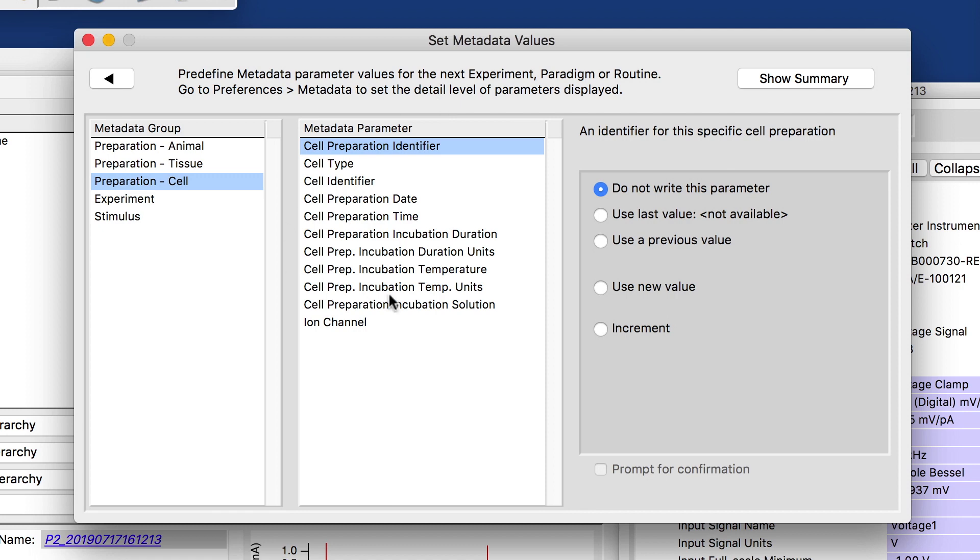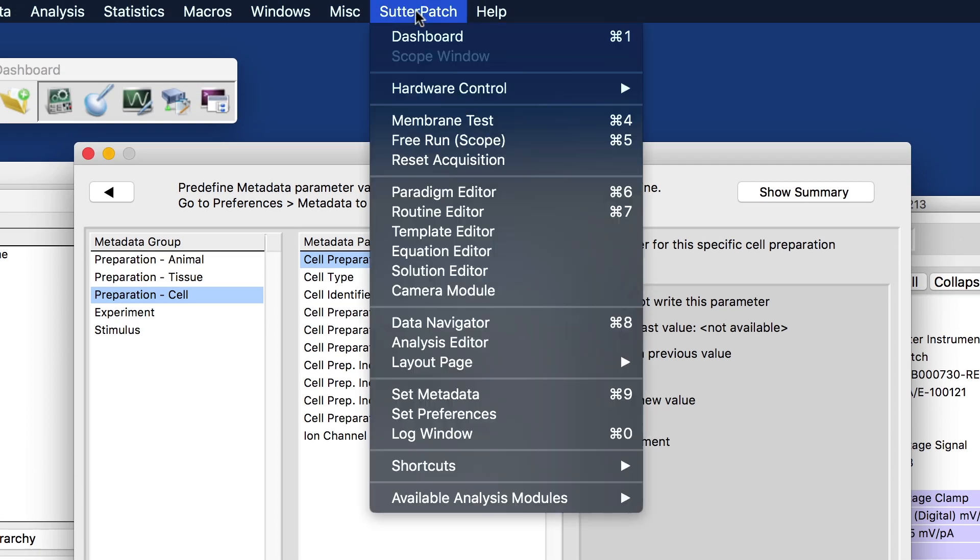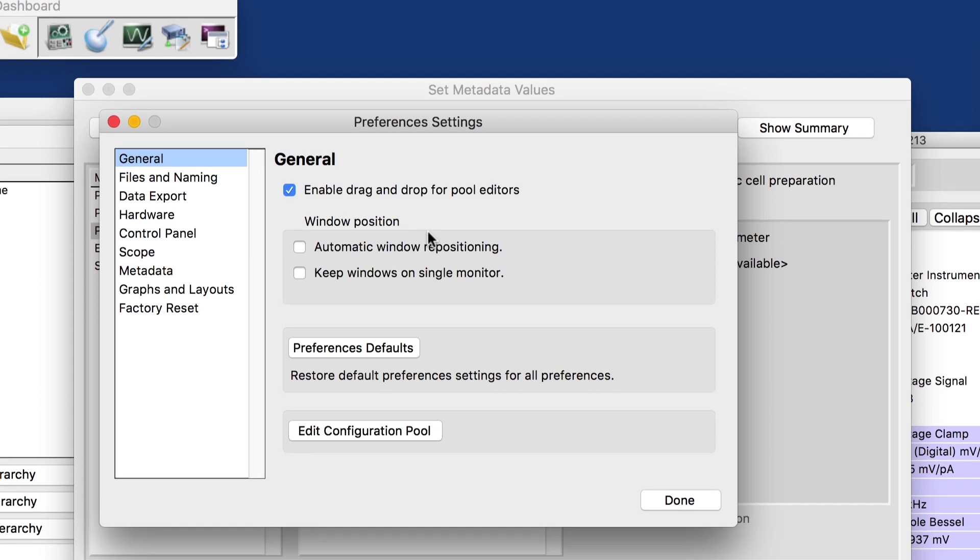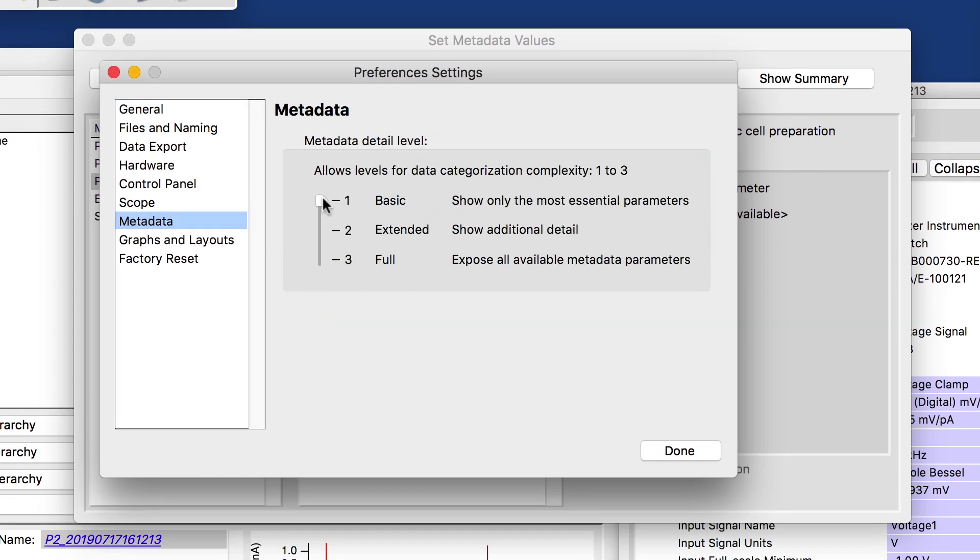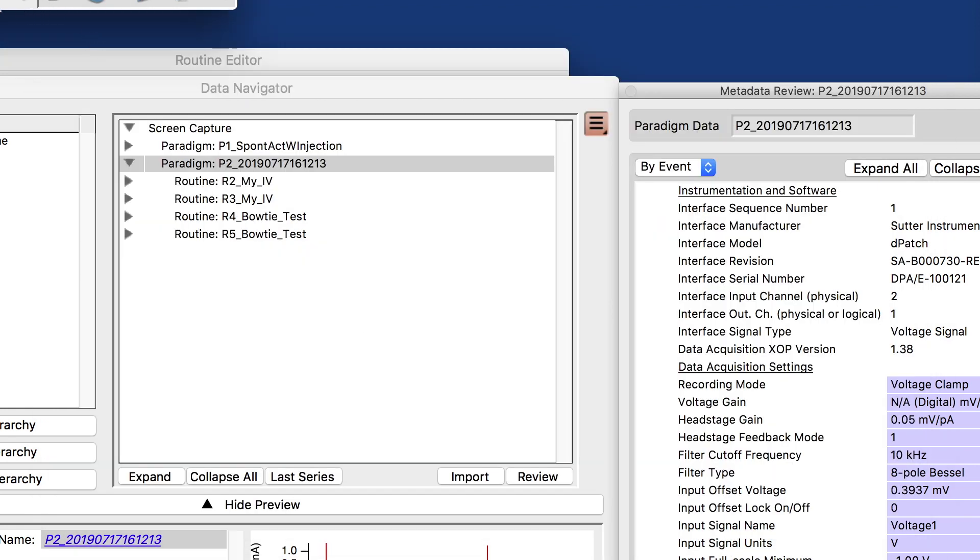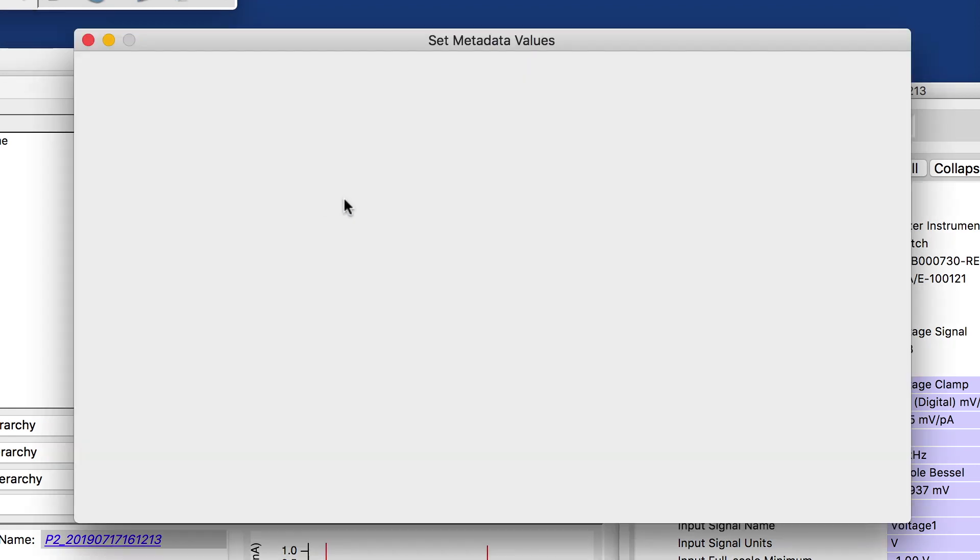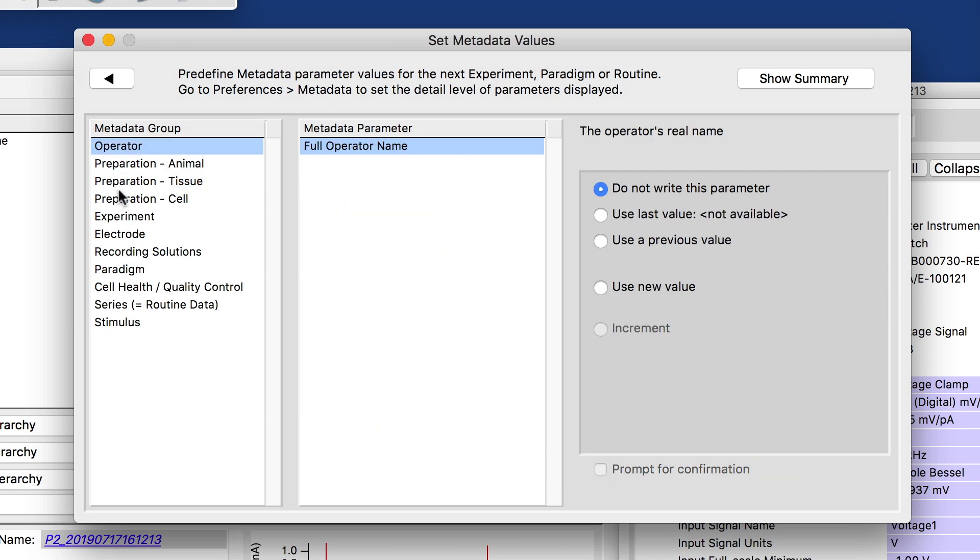If the parameters here aren't enough for you, what you can do is in the preferences, you can control the detail level and let's just quickly look at the full details. I need to close this for the changes to go in effect.